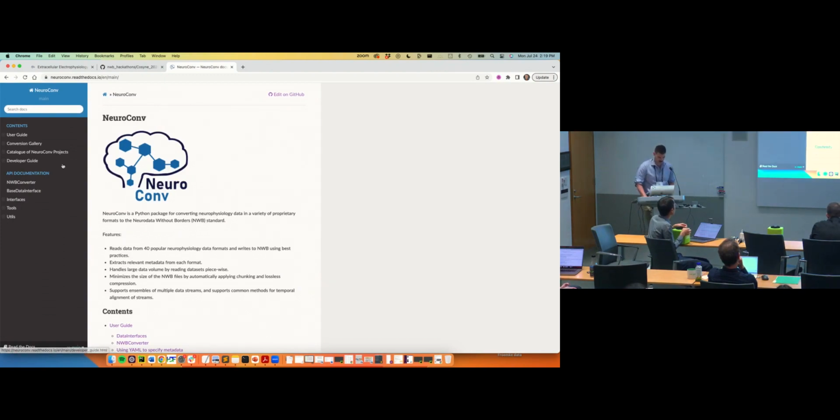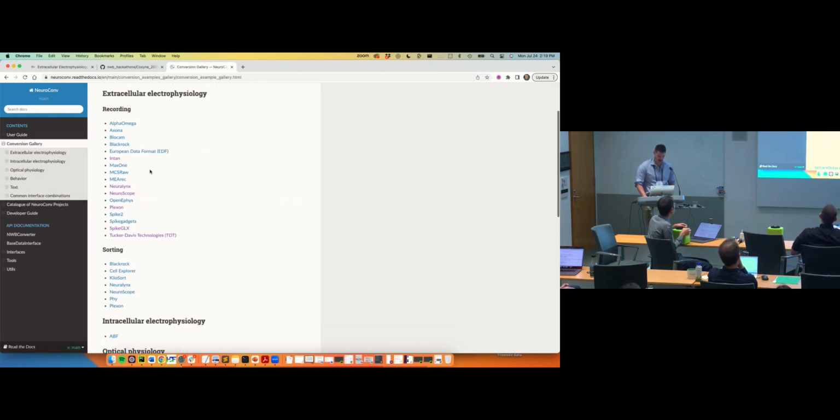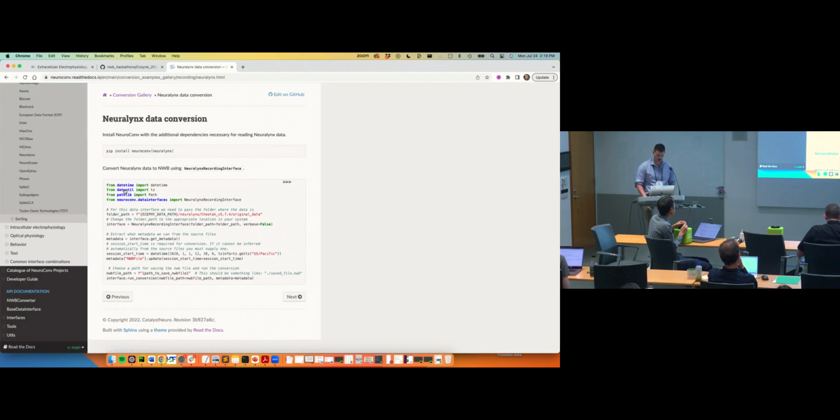Maybe I'll edit our YouTube video to put this first. So you can go to the Conversion Gallery, and under the extracellular electrophysiology, take a look at these formats and see if they work for you. If you, for instance, have Neuralynx data, here's how you install it and here's how you run it. And this will give you for free the electrodes table and the electrical series.